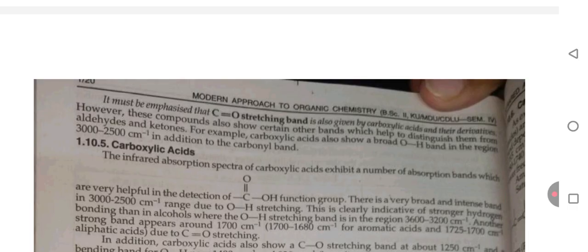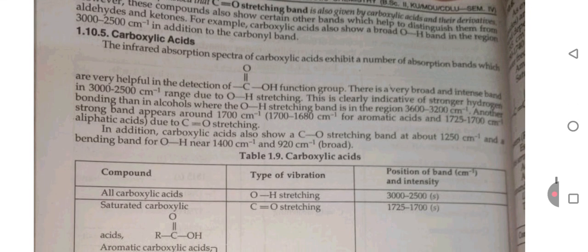Carboxylic acid. The infrared absorption spectra of carboxylic acid exhibit a number of absorption bands which are very helpful in the detection of the C double bond O, OH functional group. There is a very broad and intense band in the 3000 to 2500 cm inverse range due to OH stretching. This is clearly indicative of strong hydrogen bonding, unlike in alcohol where the OH stretching band is in the region of 3600 to 3200 cm inverse.